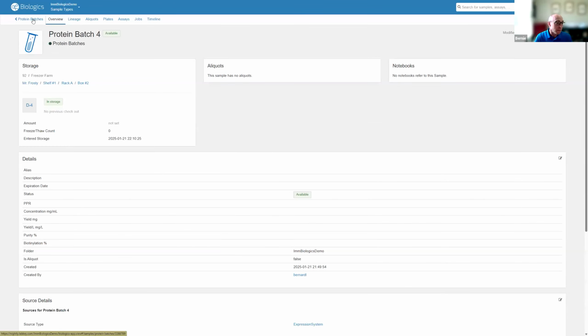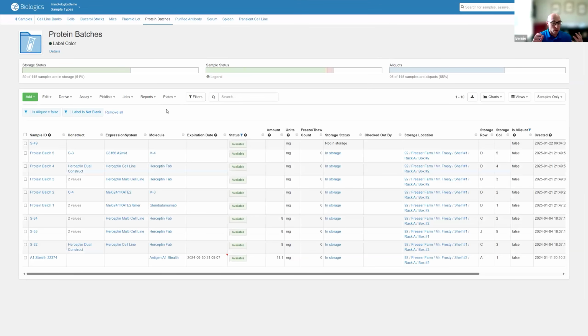Anyway, we have all of this data connected, and then what that allows you to do is really profile and track down known entities generated throughout whatever actual processes are going on.